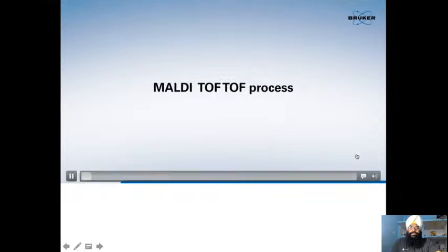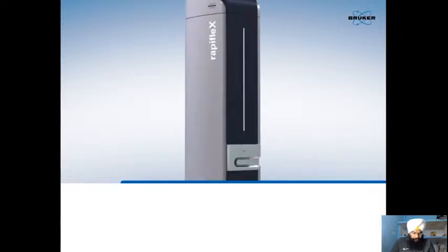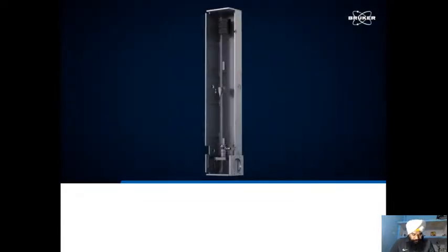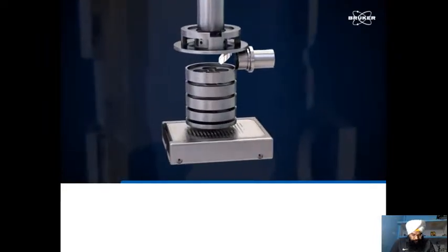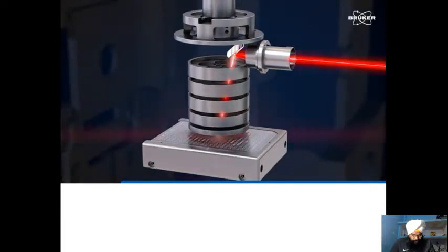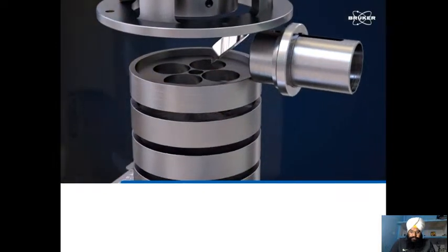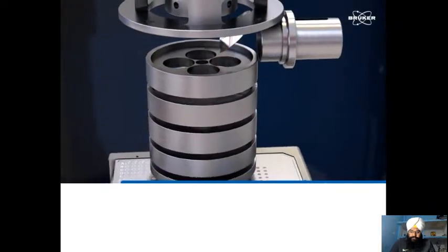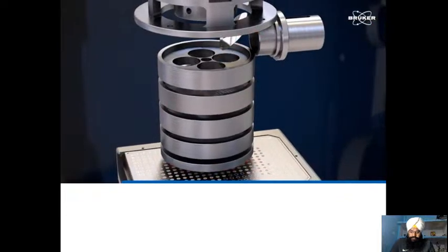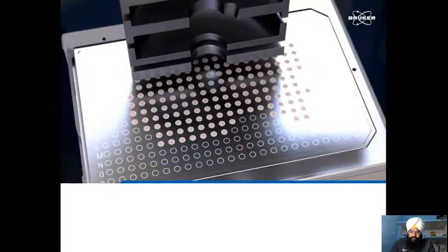Bruker MALDI-TOF/TOF process. MALDI-TOF/TOF analysis provides additional structural information for target molecules, as it is a two-phase process. Fragmentation can occur by application of higher laser energies, known as LID, laser-induced dissociation, or a background gas can be introduced to promote ion collisions. This process is known as collision-induced dissociation, or CID.